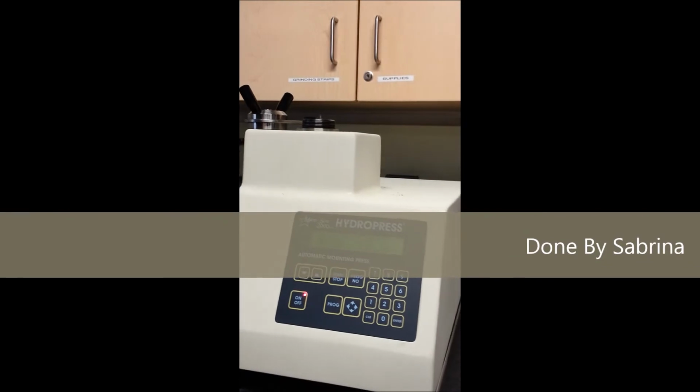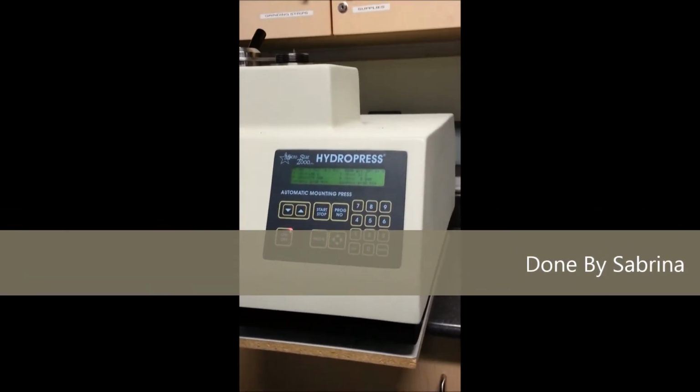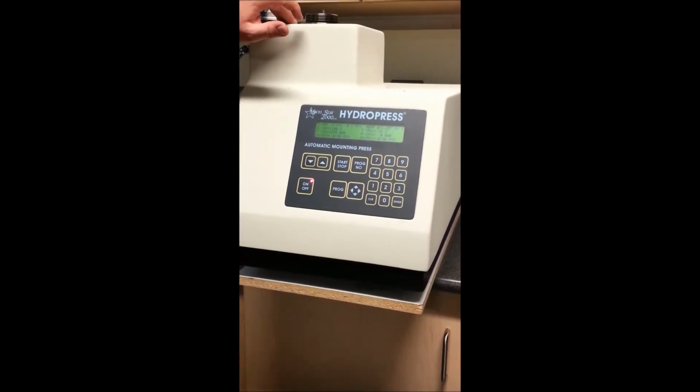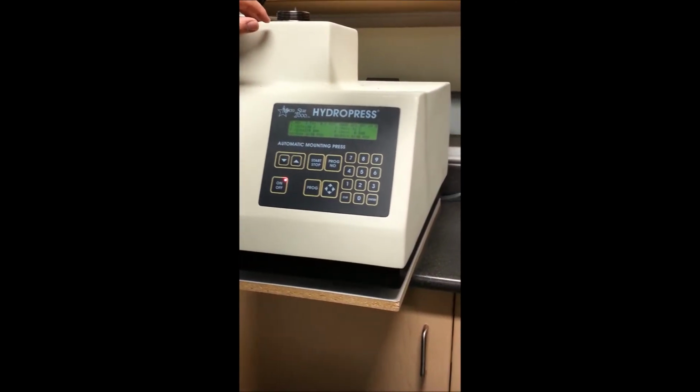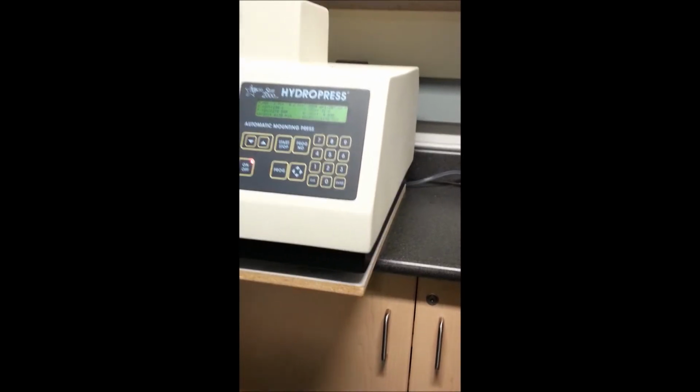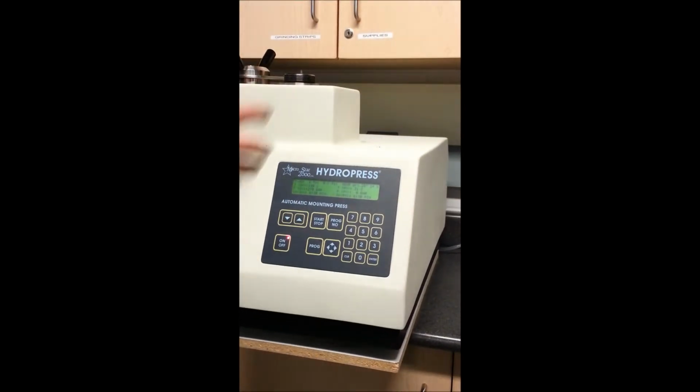Each sample was put in the bakelite machine to turn the small cut samples into a puck. This process took 10 minutes to cure and 10 minutes to cool per sample. The purpose of the puck was to allow for easier handling and identifying of the sample.